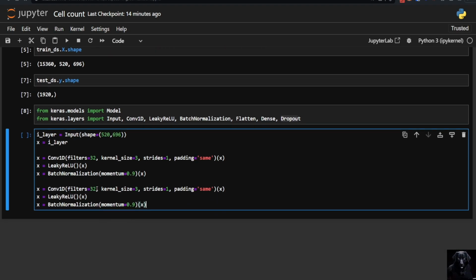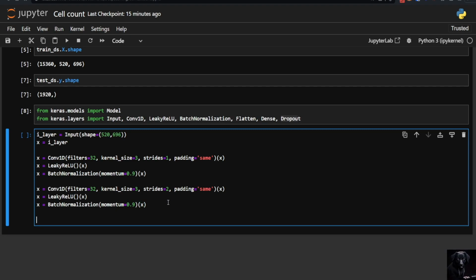Again, you can change any way you want. If you want to change to 16, that would be fine. But you could have done a for loop and changed the stride to 2 maybe here. Again, it's something you have to play with, what works best for you.